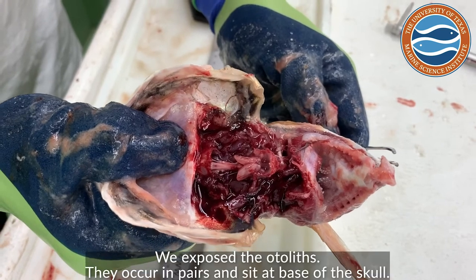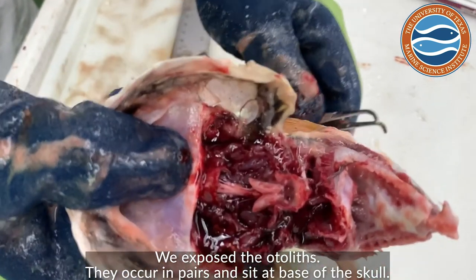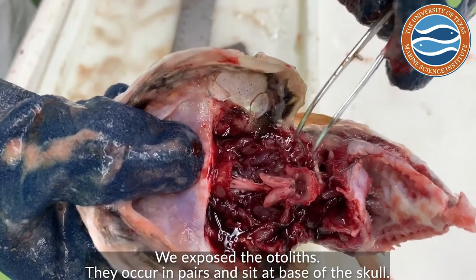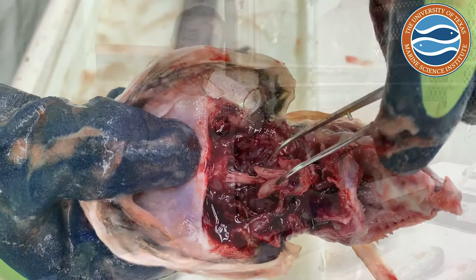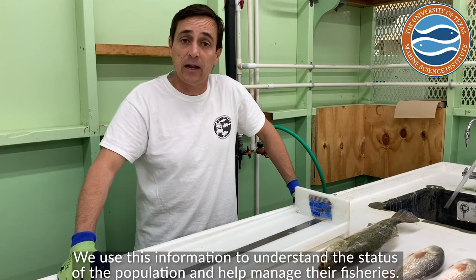We made the incision and then broke open the skull to expose the otoliths, which you can see right here. They occur in pairs and sit right at the base of the skull. This information helps us understand the status of the population and manage the fishery effectively.